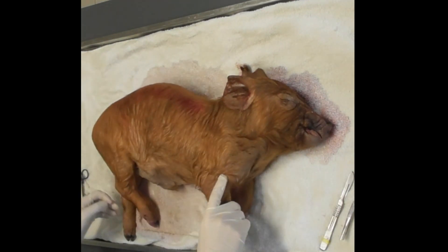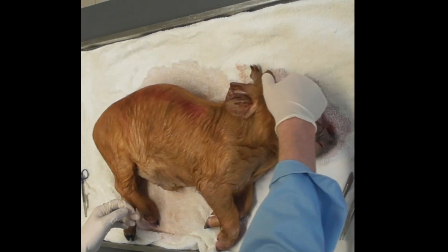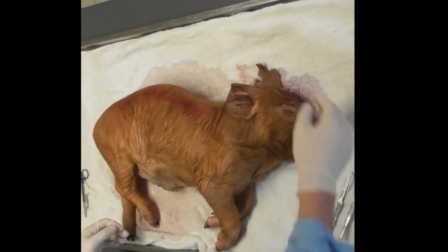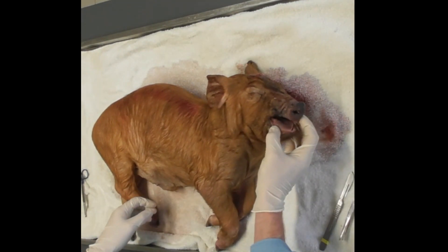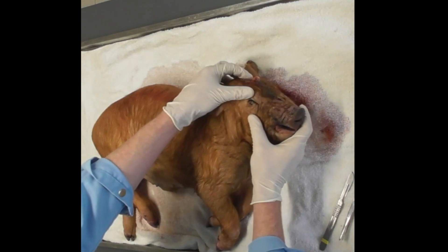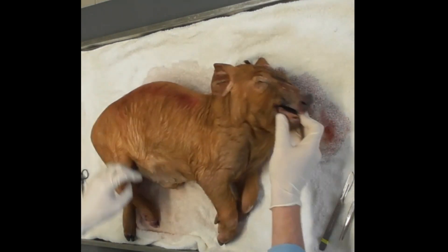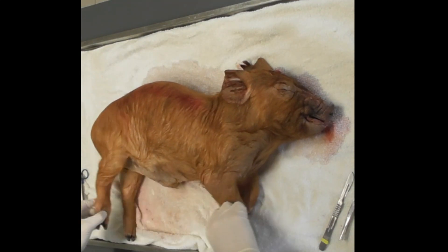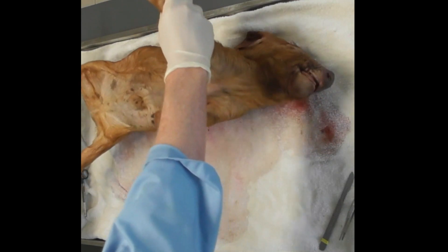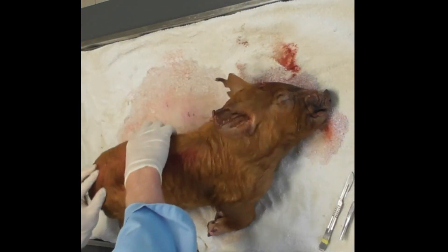First of all, we want to identify what animal it is — if it has an ear tag, make sure if it's female or male, and then note any other obvious external lesions. So we're looking at its eyes, mouth, nostrils, in between its toes, flipping it over to check for any skin lesions, and also having a look at body condition as well.